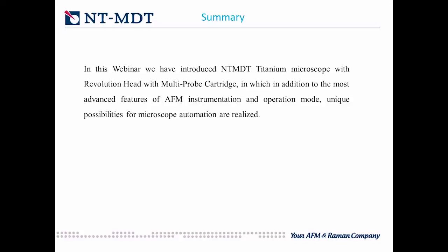For sure, it is not possible using this 100 micron scanner, which is a pretty big range. It is not possible to scan 8-10 micron roughness with this speed, of course. The flatter the sample, the bigger and bigger the speed becomes. So I hope I answered this question roughly.